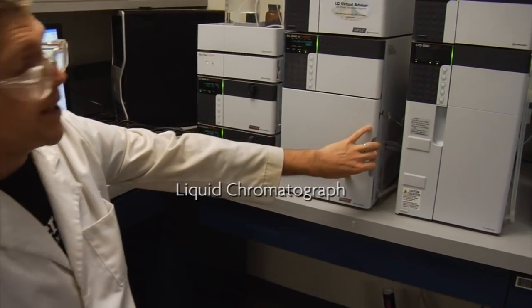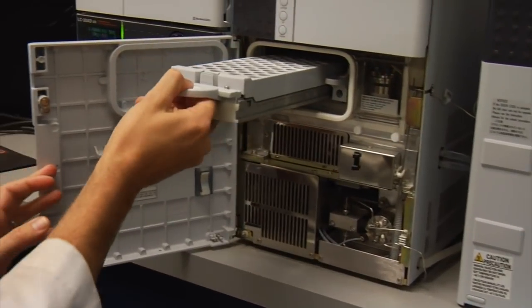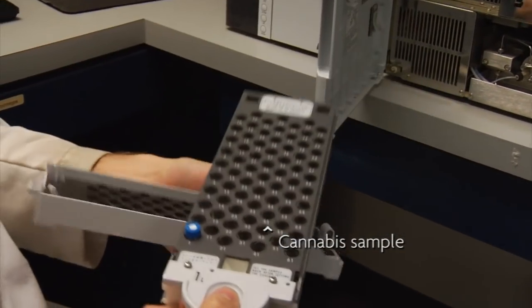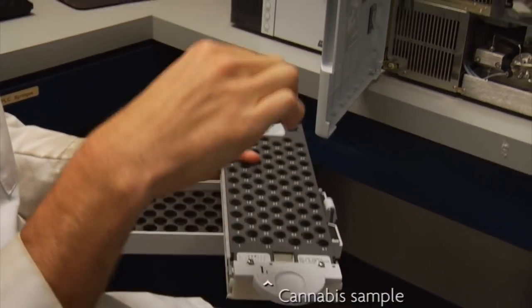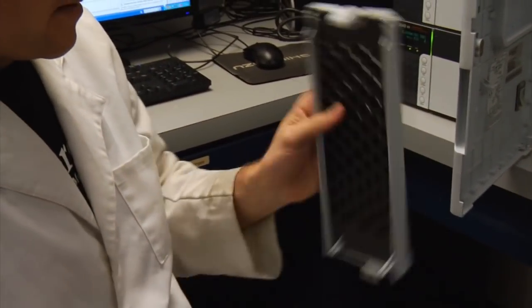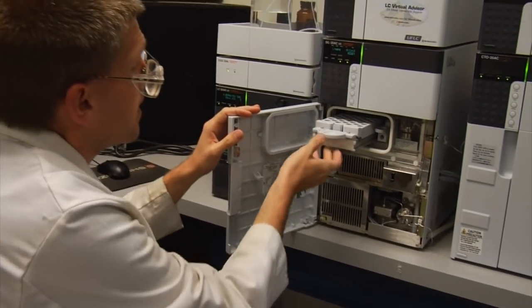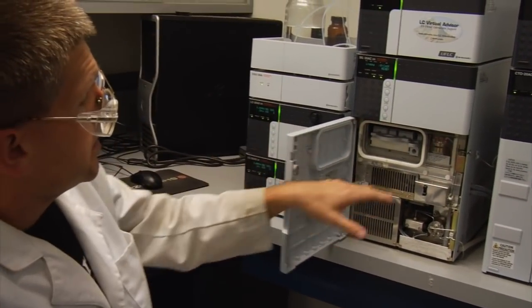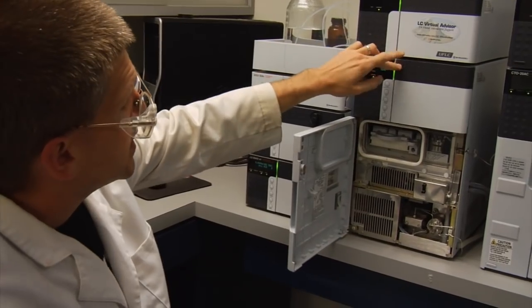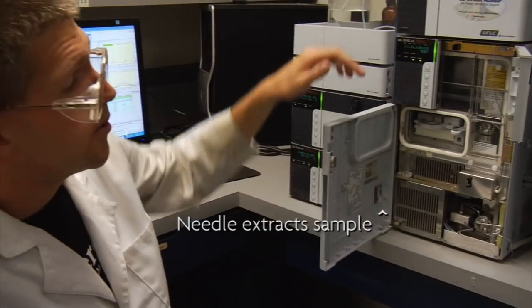We use the liquid chromatograph to quantify the different cannabinoids. How it works is the sample goes in the sample rack — we extract the cannabis with a small amount of solvent. The rack goes into the auto sampler, and there's a robotic needle in here that will automatically pick up the right vial and suck up one microliter.